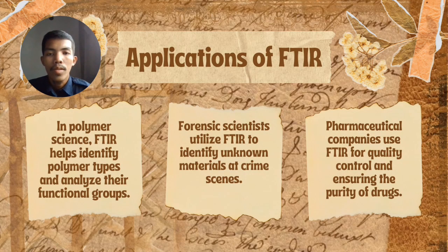Now I will share about the applications of FTIR analysis. In polymer science, FTIR helps identify polymer types and analyze their functional groups. Second, forensic scientists utilize FTIR to identify unknown materials at crime scenes. Third, pharmaceutical companies use FTIR for quality control and ensuring the purity of drugs.